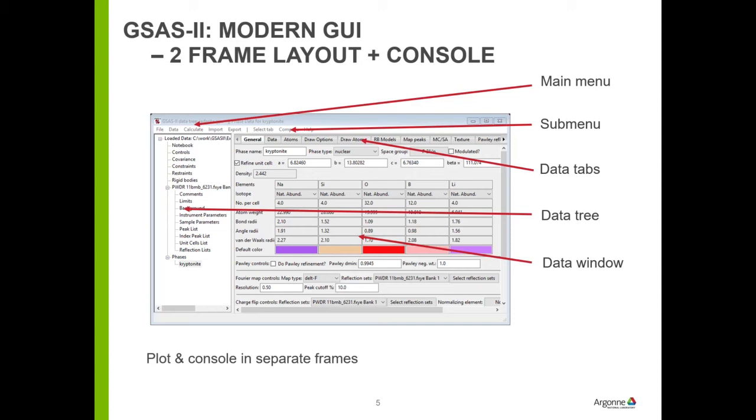I've seen some other software where there's a whole double or triple row of icons, and I find those things terrible because you say, what the heck does all this mean? So we focus on exactly what it is you need to be able to do for whatever it is that you're looking at. So you do have to remember where stuff is, but we hope we've laid it out in a reasonably logical fashion.